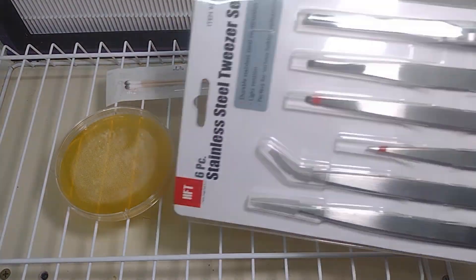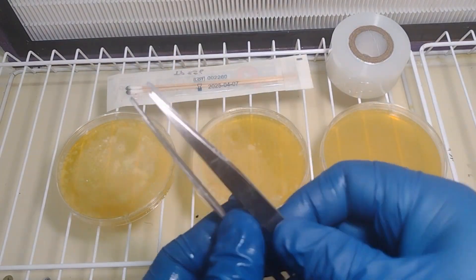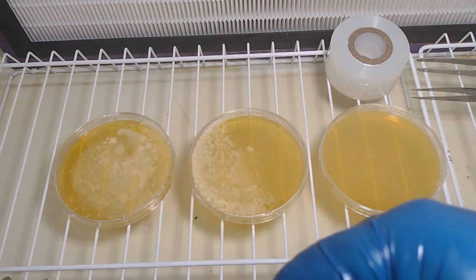So first we need a spore swab. I have some grafting tape set aside and I have these tweezers from Harbor Freight. So I'm going to wipe down with some isopropyl alcohol, and I've chosen the tweezers that I want.